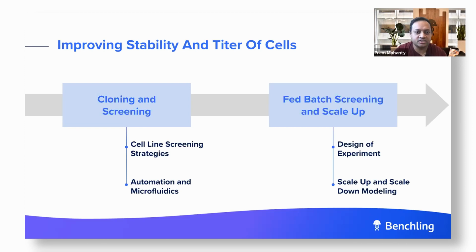Cell line screening strategies and processes continue to be optimized and automated to improve process flexibility, cell line stability and titer, and increase robustness in producing high quality cell lines. Early on in cell line development, you might evaluate different cell line screening strategies such as FACS-based screening or clone picks, mammalian colony picking, or even evaluate automation or microfluidics for simultaneous high throughput screening.